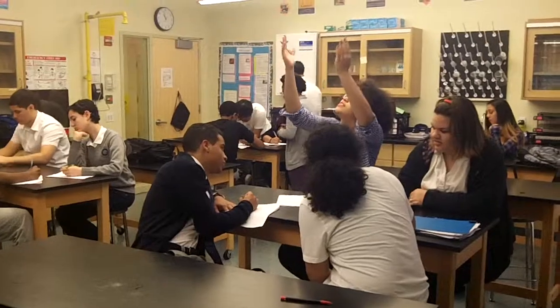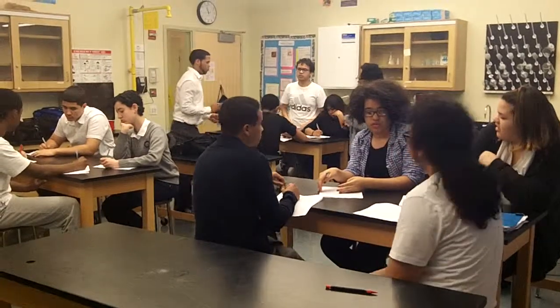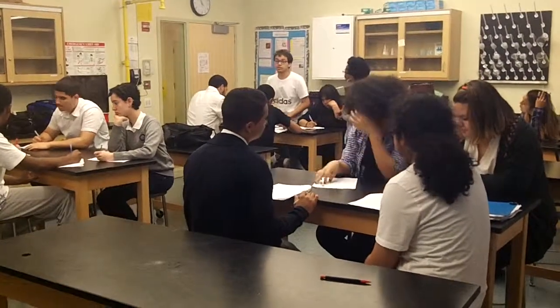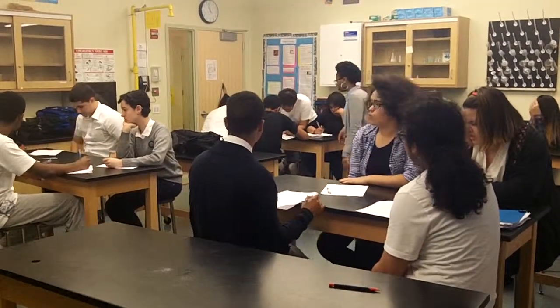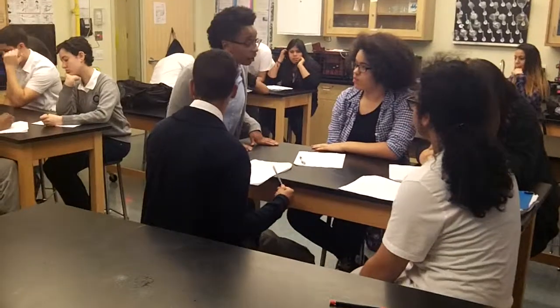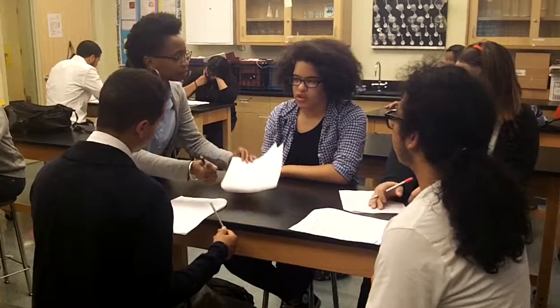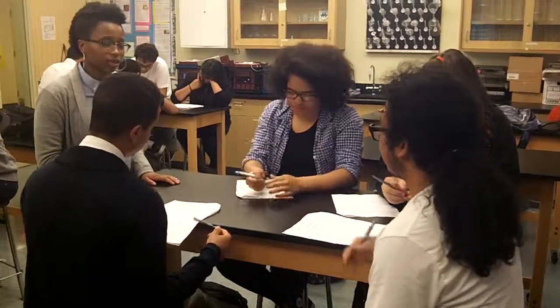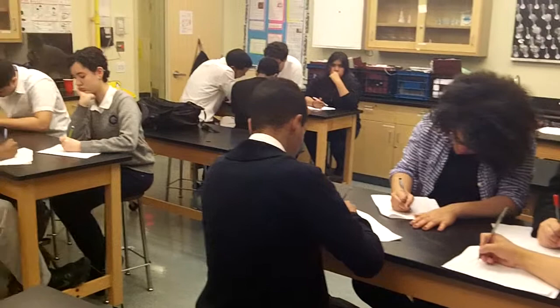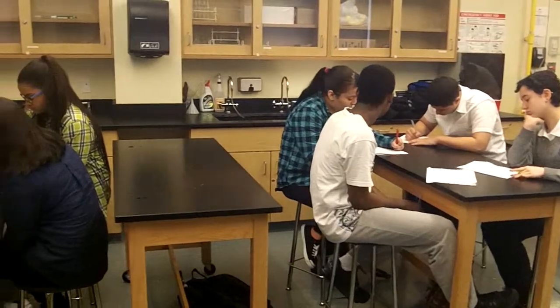Start by writing it in questions. And let's think about which variable your group wants to test. Surface area? Okay, so start by writing your question. Yes. So you got it? Nope, we're not at hypothesis. I'm just thinking. And I'll show you when we get to hypothesis, it's right on the back. Will the surface area affect the experiment? So that's a question that you could ask. We want to investigate that today. Start by writing it down. The rate of reaction.